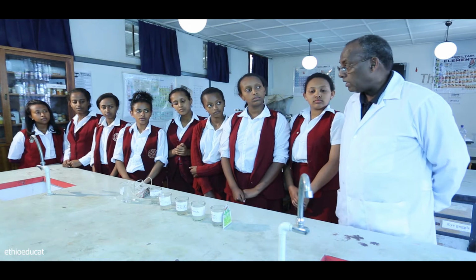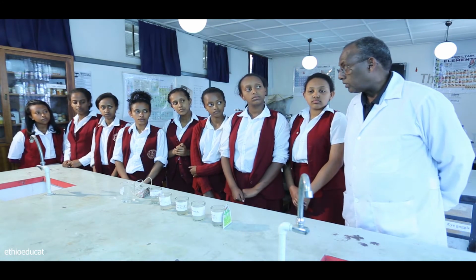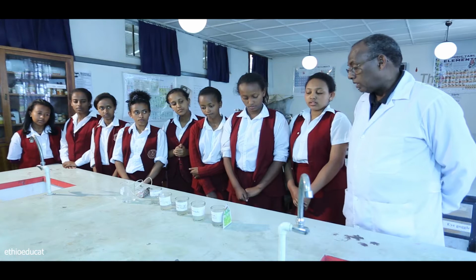Sodium is an ion, so is chloride, but they have opposite charges. It is the electrostatic interaction between them that keeps them together until something like a solvent, in this case water, pulls them apart. Today's demonstration will help us see if the bonds are either covalent or ionic.